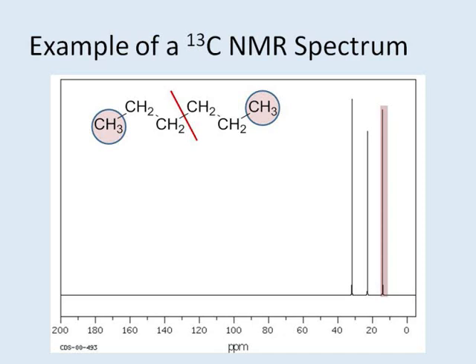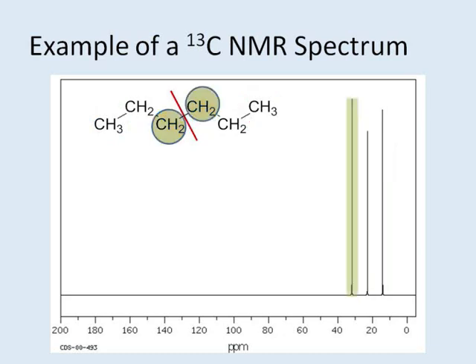So do the adjacent CH2 groups, and so do the 2 central CH2 groups. Consequently, this explains why there are only 3 peaks in the carbon-13 NMR spectrum of hexane. With regards to the relative chemical shifts, we see that the CH3 groups occur upfield from the CH2 groups. This is typical for organic compounds.